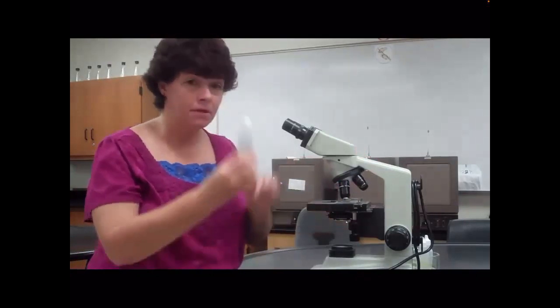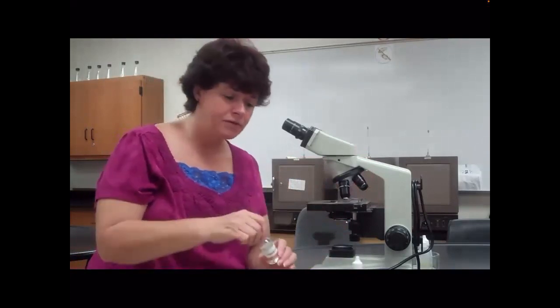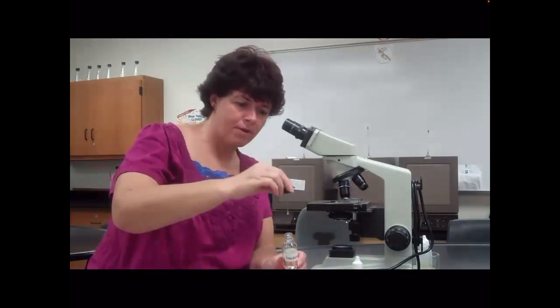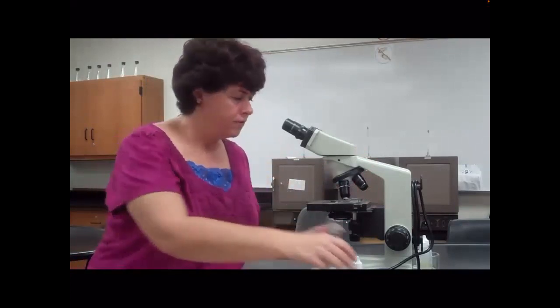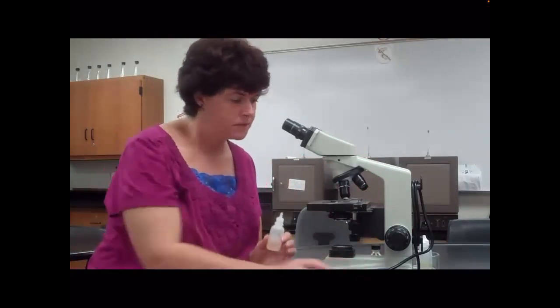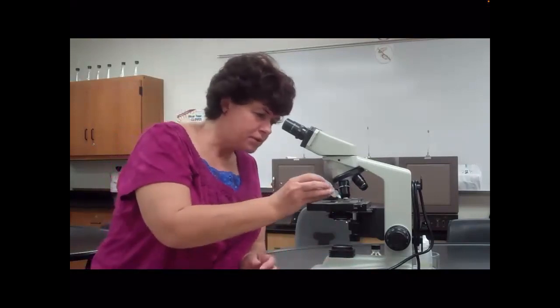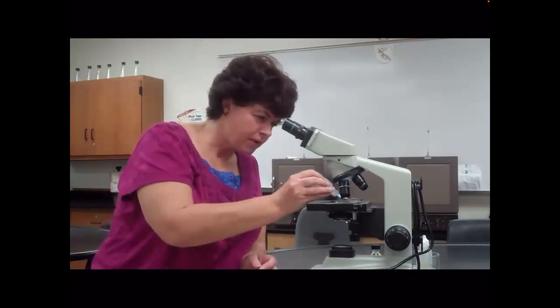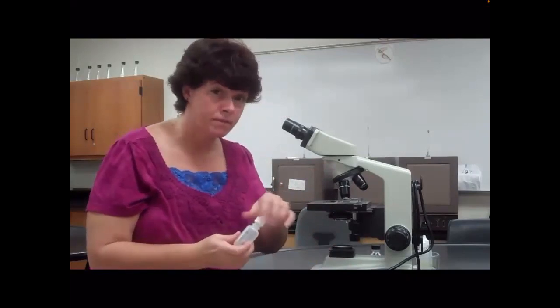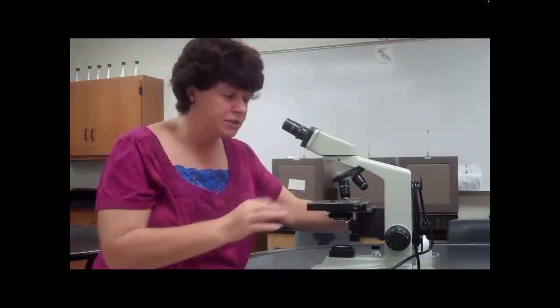Now I'm going to take oil. It may be in a bottle like this, or a bottle like this. Doesn't matter. If I use this, I have a little medicine dropper thing, and you'll let the oil drop off. If you use this, it's a dropper bottle, and you just squeeze a drop off. Doesn't matter which one you use. You put the smallest drop of oil you possibly can. Do not touch the slide with the actual bottle or the dropper. Only let the oil touch the slide, and it'll pull it off the dropper.